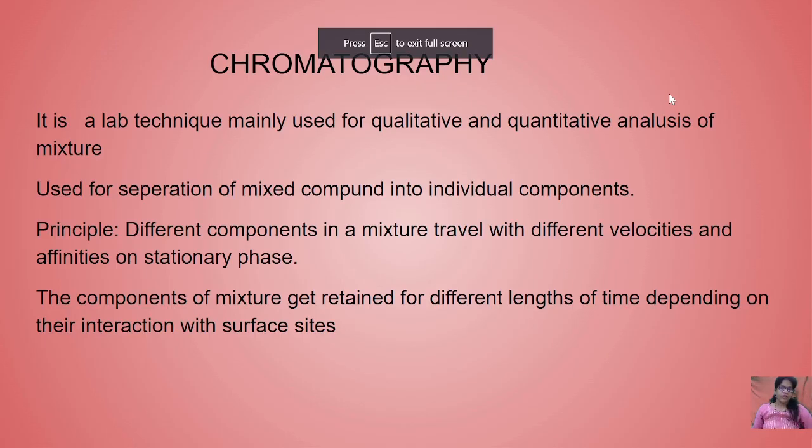In this class I want to discuss the technique called chromatography. What is chromatography? Chroma means color, right? It's a lab technique mainly used for the qualitative and quantitative analysis of a mixture. When you get a mixture of sample, based on the type of solvent and the type of stationary phase, the affinity towards them is regarded as the principle for chromatography.